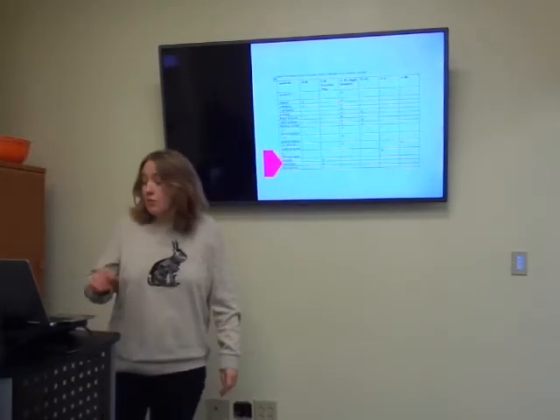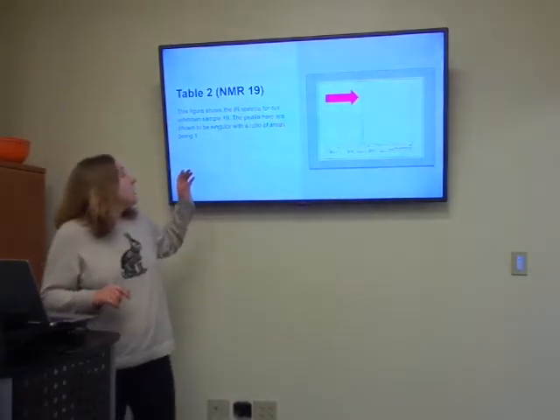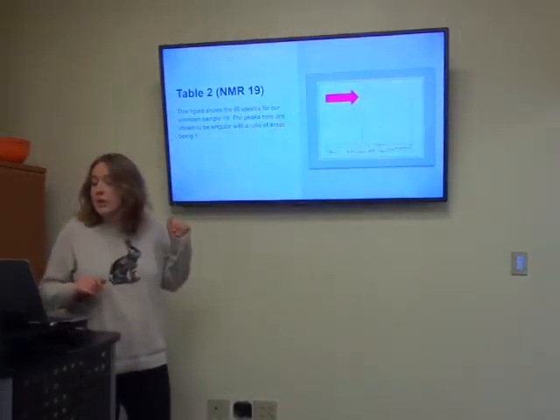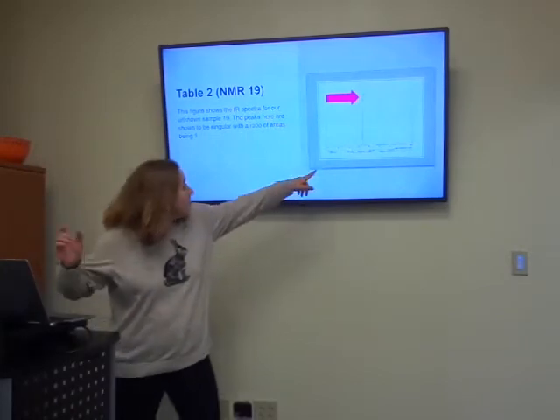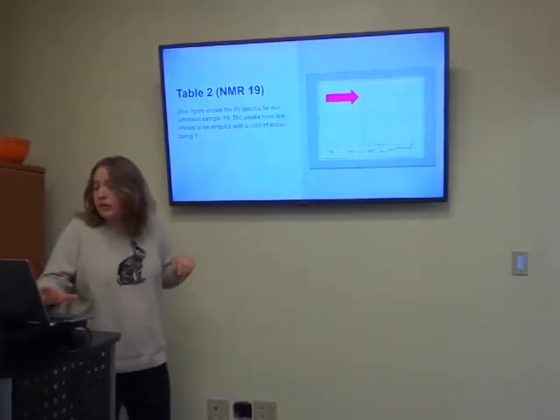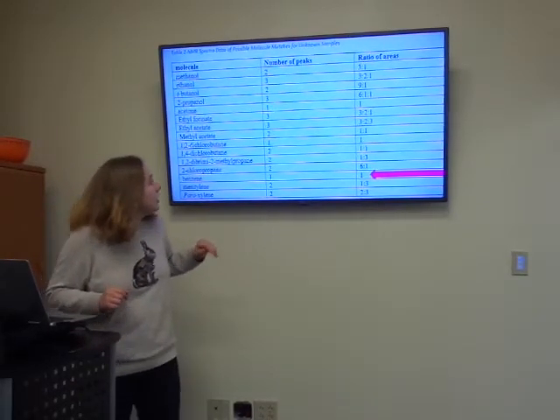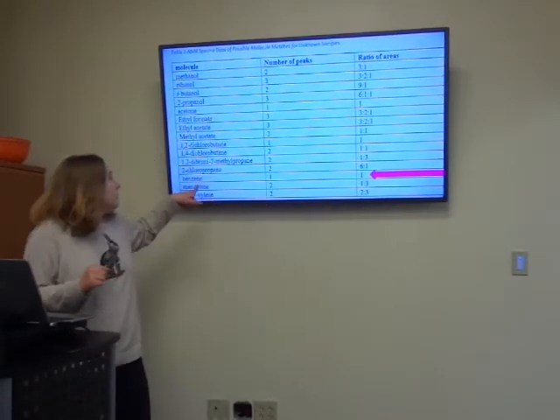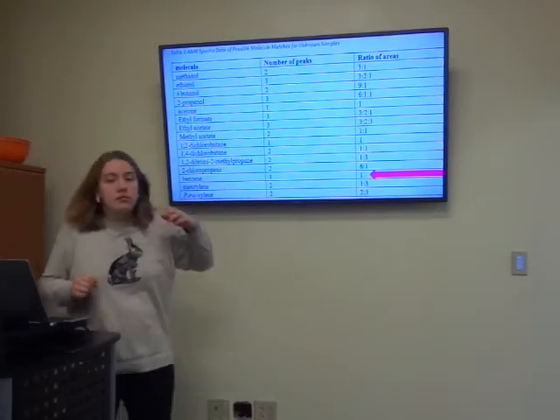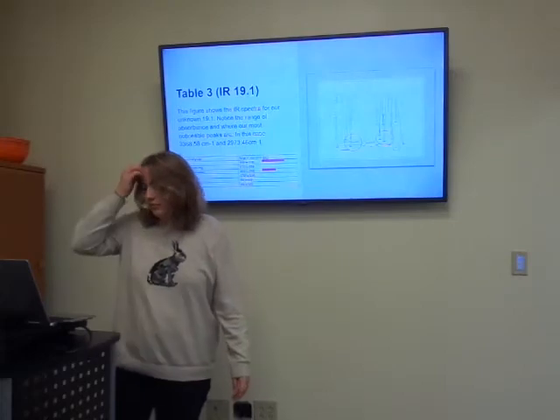So to whittle it down even more, we're going to go ahead and take a look at an NMR spectra of it, which shows that it has one peak here, and it has a ratio of just 1. And of our possible candidates, looking at the NMR, really only benzene has the 1 peak in the 1 ratio.